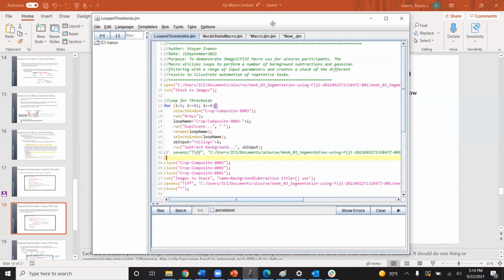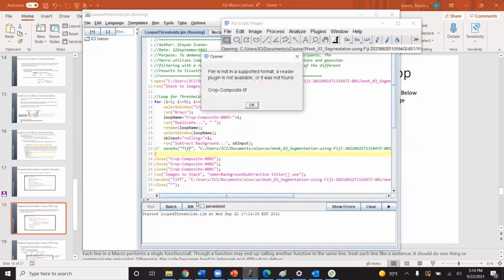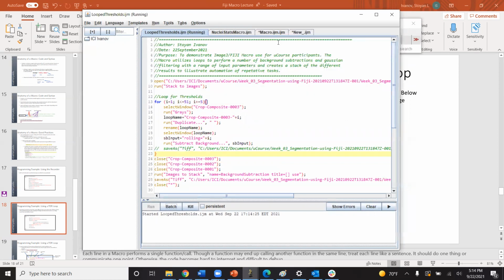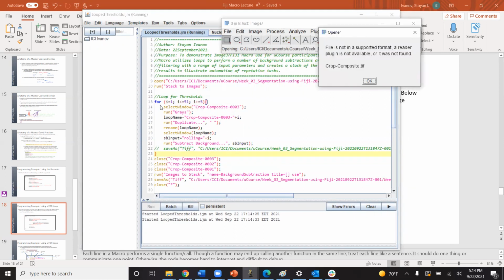So let's try and run this. Now let's try and run. And we have an error. What is the error?